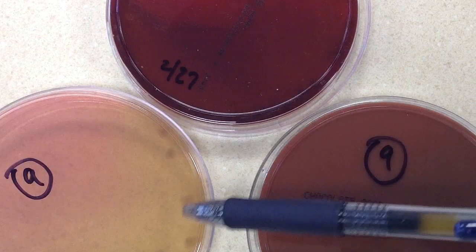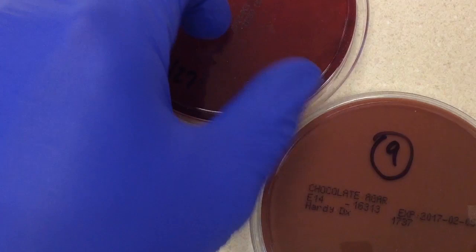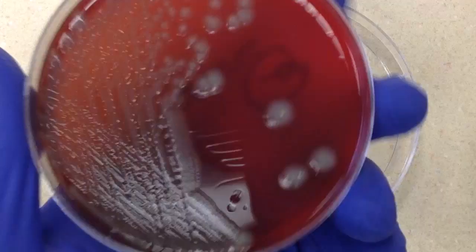Today, we're looking at a sheep blood plate, a chocolate plate, and a MacConkey plate. Some facilities may also add a CNA plate. These are just the plates used in this teaching laboratory. Let's go ahead and take a look at them, starting with the sheep blood plate.